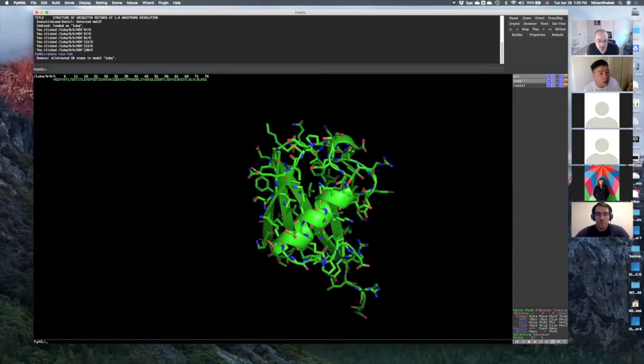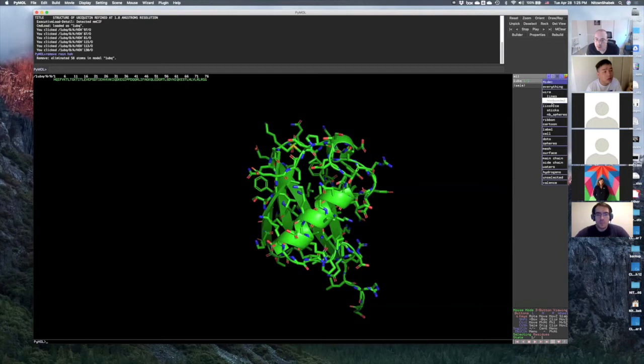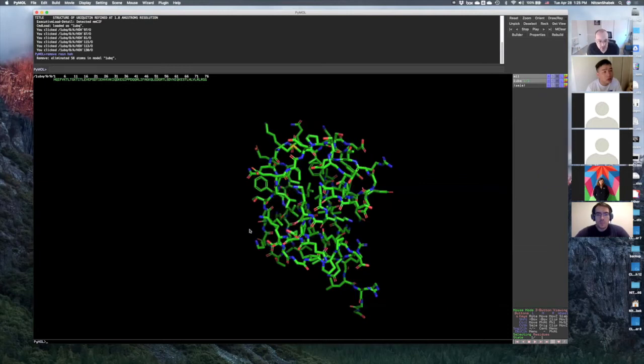Okay? Now let's hide the cartoon and just look at the amino acids. So instead of show, we go to hide and hide the cartoon.